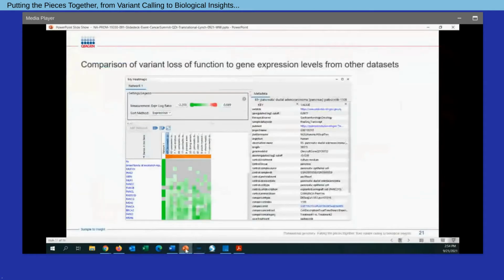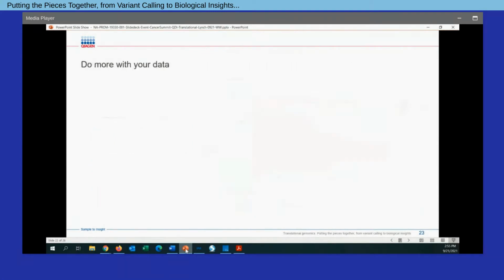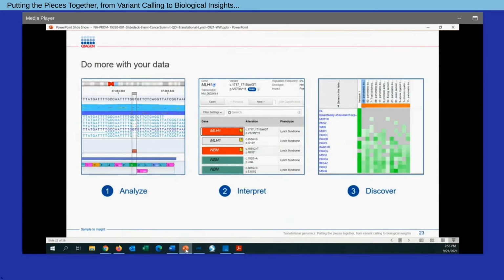So with that, I'd just like to conclude. I'd like to mention again, everything that we've looked at today really falls under our Qiagen Discovery Insights portfolio. We talked about earlier using the Qiagen CLC Genomics Workbench to move from FASTQ to identification of variants. And then for interpretation purposes, we talked about at the variant level, Qiagen Clinical Insights Interpret Translational and Ingenuity Pathway Analysis. And ultimately, hopefully what I've shown everyone today is that we've walked through the step of going from FASTQ files using CLC Genomics Workbench to analyze and call variants that are accurate and with confidence.